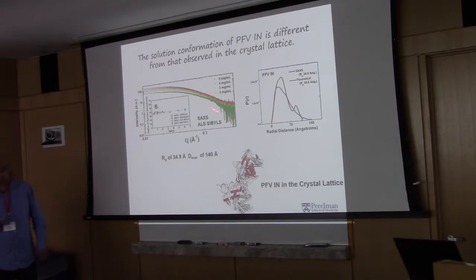So now, you do the X-ray scattering experiment. You take many concentrations and see Rg is consistent. You compare the shape distribution function, P(r), to that of the monomer observed in the crystal structure as bound to DNA. And the first thing that was very apparent was that the P(r)s are very different, and the Rgs are measurably different. So whatever is happening in that transformation from the DNA-free form to the DNA-bound form involves some type of conformational change that changes the distribution of the interatomic vectors.